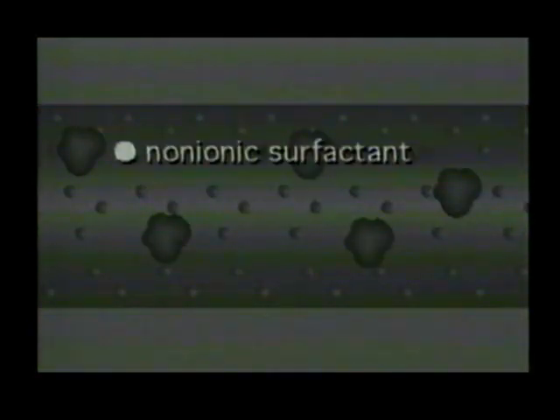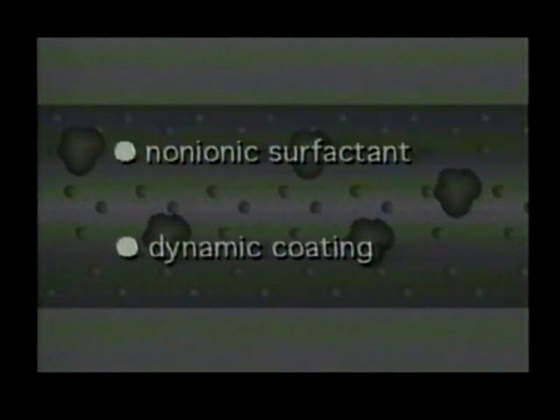It is possible to derivatize the silanol groups, significantly reducing the negative charge. Such a coating considerably lowers the electroosmotic flow. Other types of coating leave the walls with a net positive charge, which is beneficial particularly for highly basic proteins, such as lysozyme.